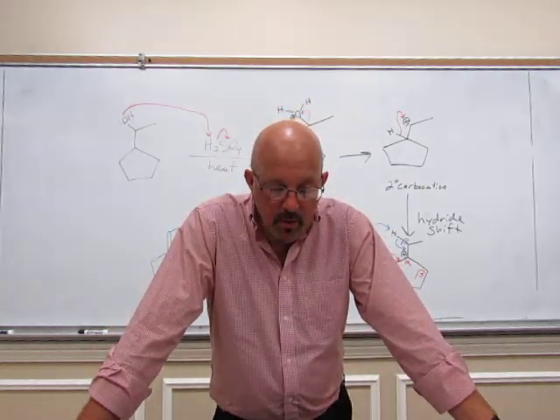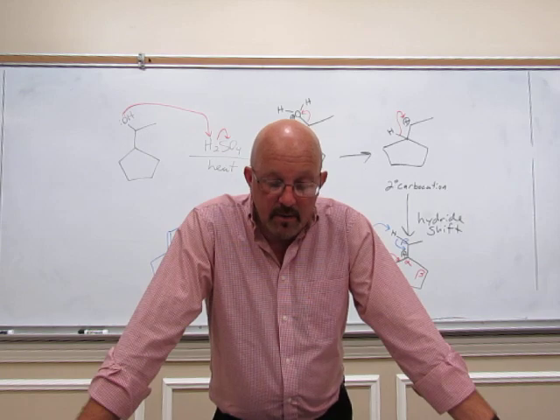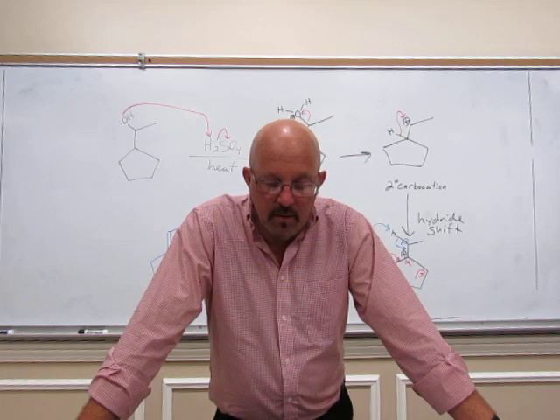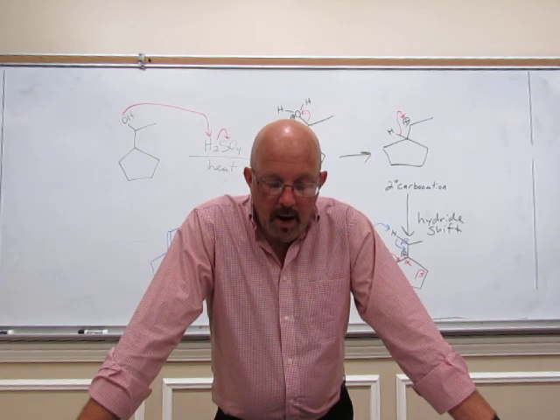On the procedure, we're taking 2 mL of water in a 5 mL long-necked, round-bottomed flask. So you got 2 flasks in your kit. One's got a short neck, one's got a long neck. Get the one that's long necked. We're adding in 1 mL of concentrated sulfuric acid.